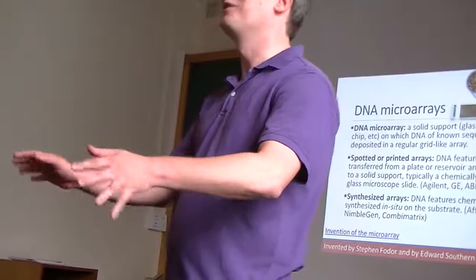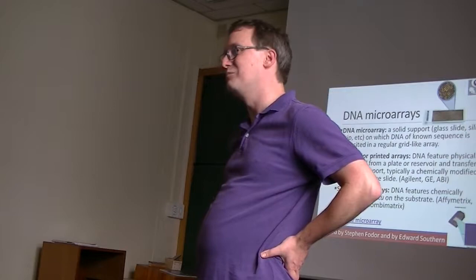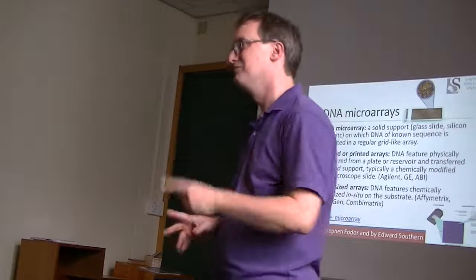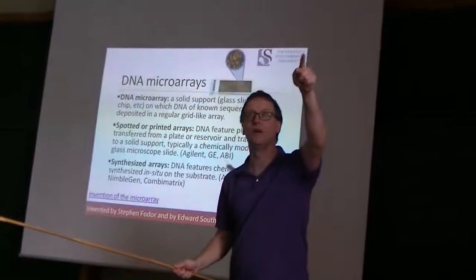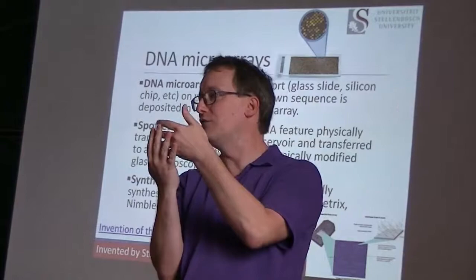René Descartes created a system that we call Cartesian coordinates. Now that still may not ring a bell with you, but most of us have used XY plots, right? You've got the x-axis here, you've got the y-axis there, and you have some ordered pair that fits somewhere in that quadrant. So we have a Cartesian grid where you've got little addresses in a whole row, and they're also in equal columns, so you have stripes of them in that direction as well. At the intersection of vertical and horizontal lines, you have a probe on this microarray.